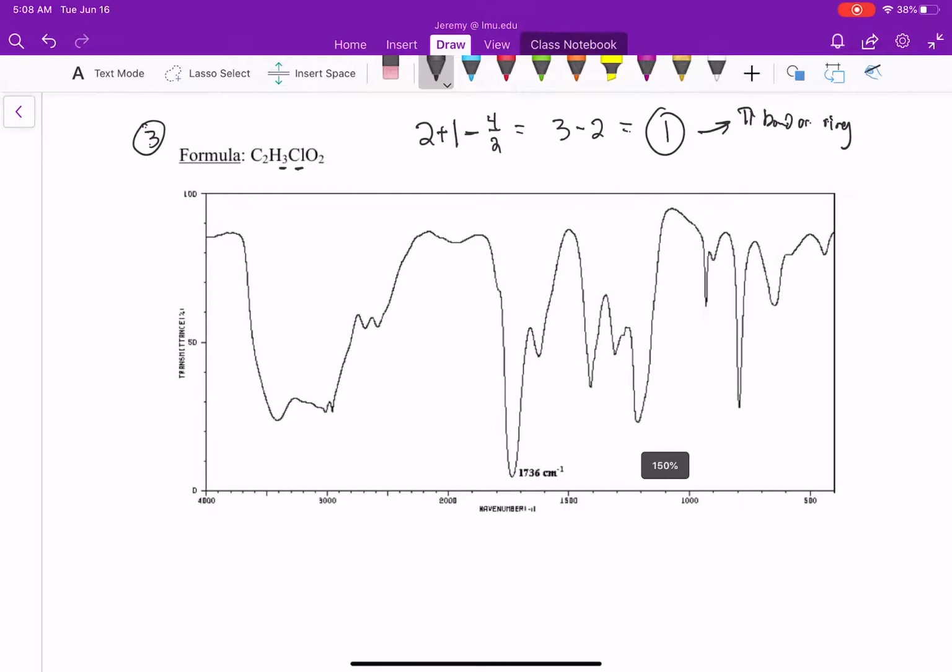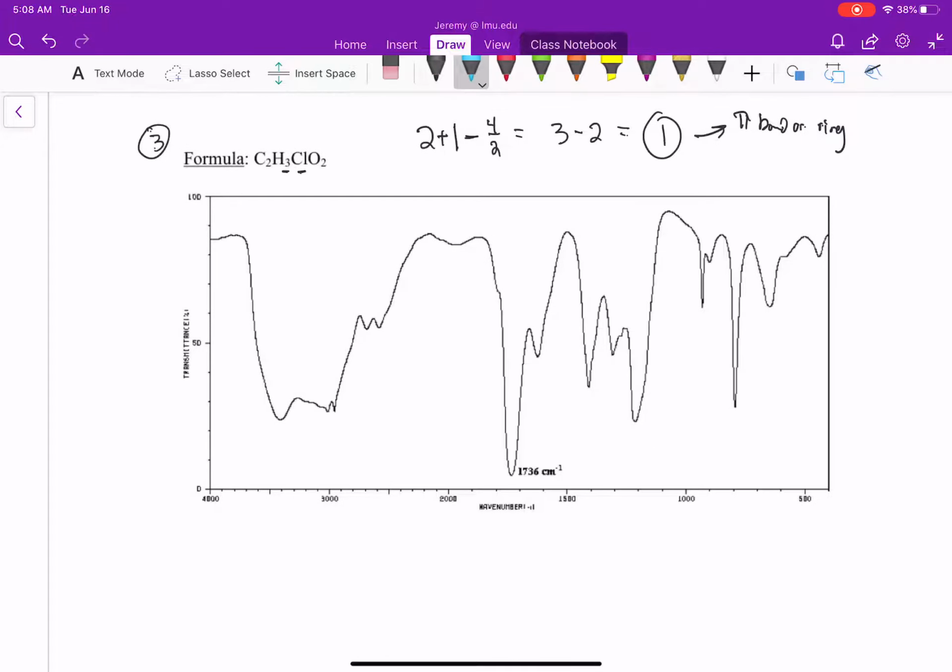Let's analyze our spectrum. As we go through here, I have something that looks like it's starting in zone 1, but this giant peak here is clearly into zone 2. What is that peak? What we should remember is that is our OH of a carboxylic acid, right?